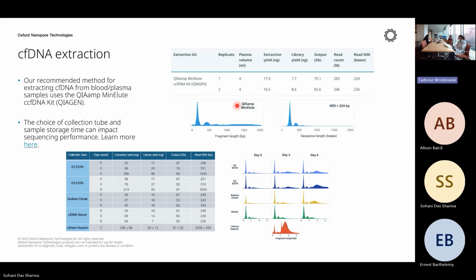Finally, from the barcoding step they followed the Nanopore protocol, but prior to that they optimized their own protocol. The data quality actually looked good, so you can check that paper and it might be useful.